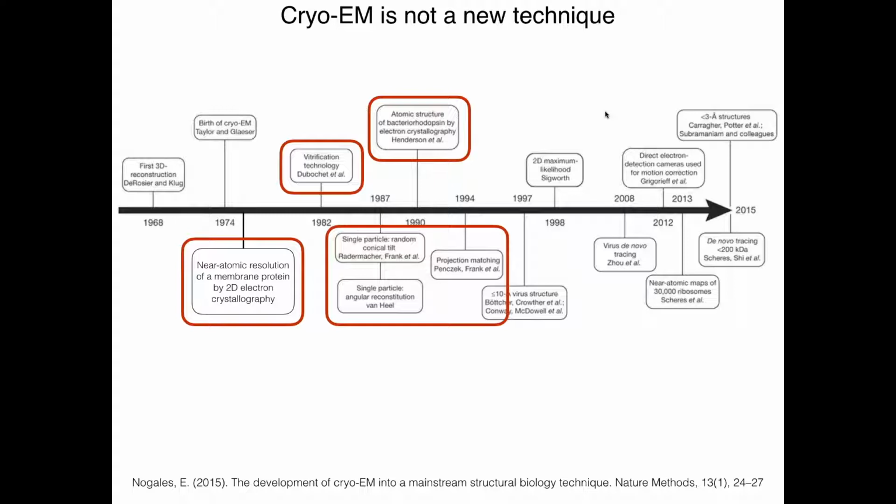And the single particle aspect, so based on the slide that I just introduced, the single particle cryo-EM and the methodology surrounding it, alignment, classification, ab initio reconstruction, refinement, these have really been developed throughout the 80s, 90s, and continuing into today.